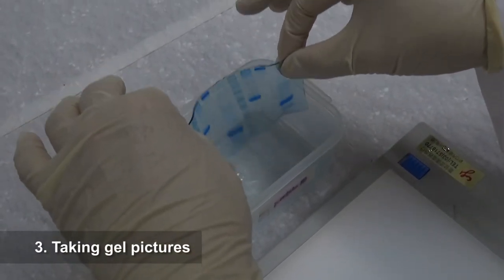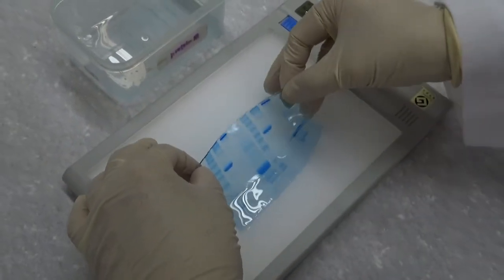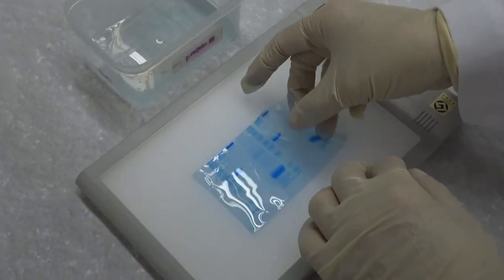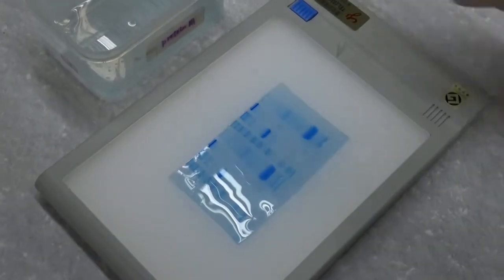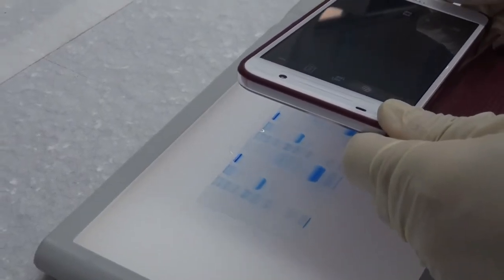Taking gel pictures. Pour away the water after washing. Pull the gel by hand to allow excess water to drip away and spread the gel on a light box. Turn on the light. Take gel pictures using a cell phone or camera.